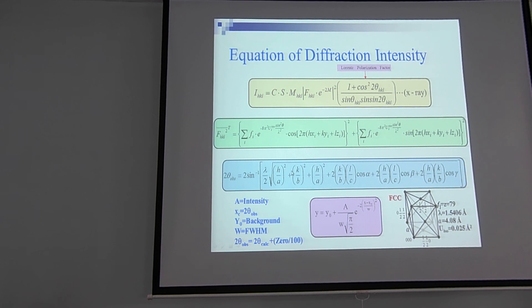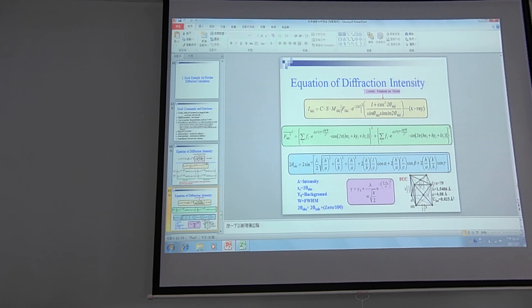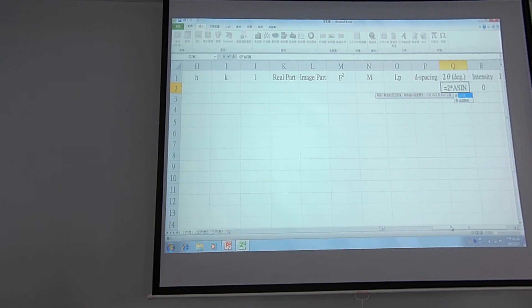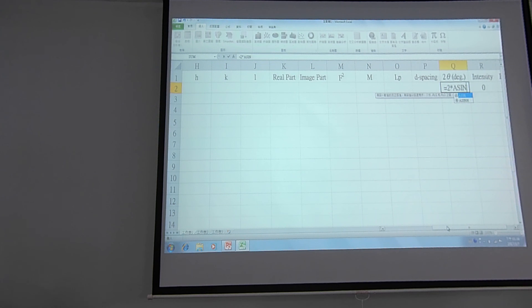We will utilize this equation in the Excel cell. The 2θ is equal to — using the ASIN function — if you don't know how to write the arcsine, you can check the last page of the Excel command sheet. ASIN means the arcsine function.